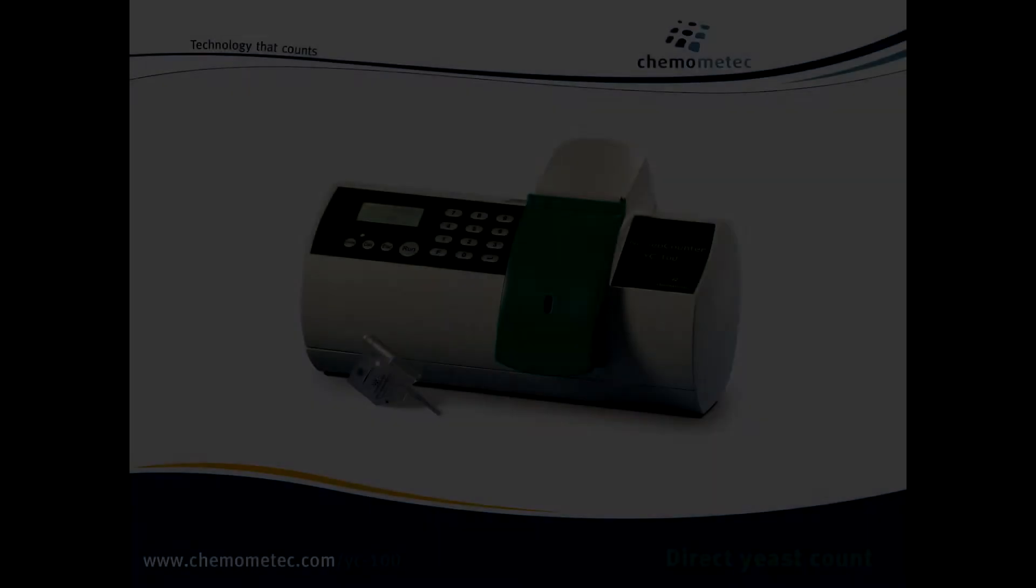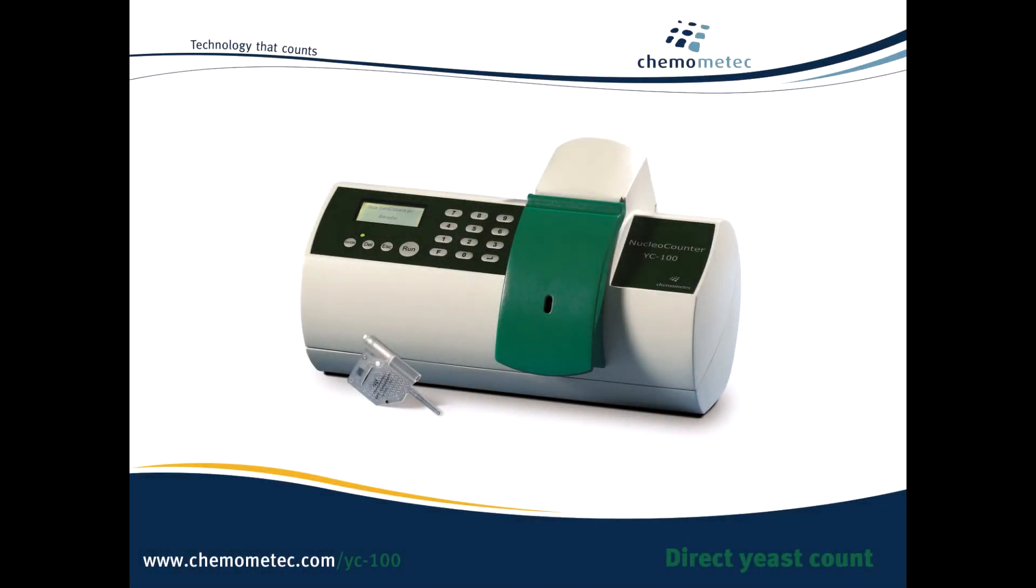So if you need powerful, reliable cell counting and viability, look no further than the YC100 from Chemometec.